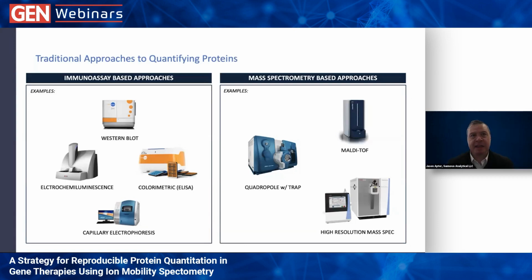It makes sense, and a nice part about this discussion is the ability to transition through various techniques, like the all-encompassing fit for purpose. But it sounds like, as we progress closer to the clinic, and you get into, Mark, as you said, the GLP tox and everything, the need for accuracy, selectivity, sensitivity, and reproducibility really becomes accentuated, and making that trade-off becomes important, and hopefully that's what drives more and more of the pipeline from preclinical into the clinic, frankly.